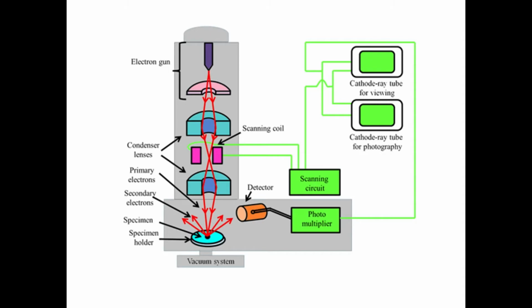First you have to open the cupboard, load the sample, then tighten it, seal it, then you have to make the vacuum. After that only you can go for analysis. This is also one of the major disadvantages, because we have to wait for 15-20 minutes or sometimes longer, depending upon the capacity of the vacuum creating machines or equipment or pumps.